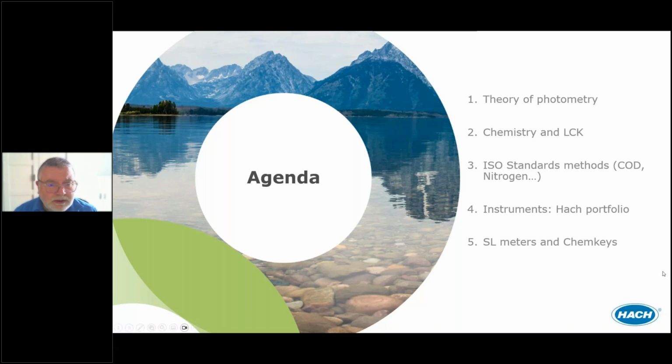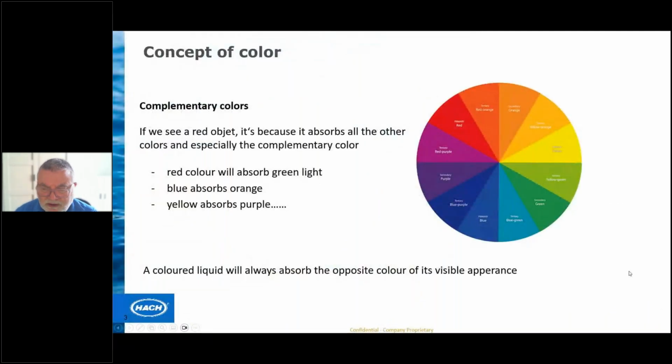First of all, a little bit of theory. What is color? To approach the concept of color, we must understand the concept of complementary color.